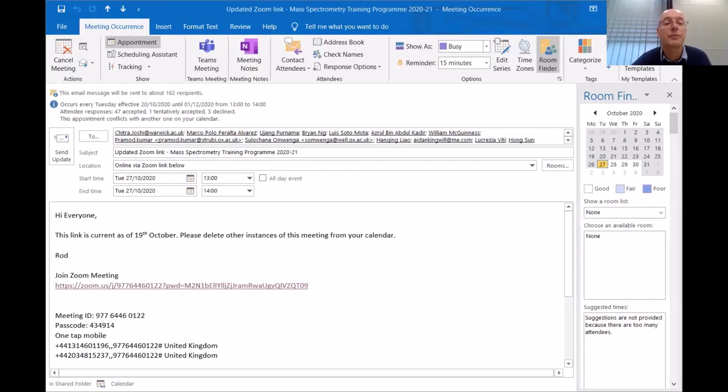I have a question. Whenever we put in the miscleavages, can you connect that to what it means in the actual data that we're seeing? Does it relate to protein coverage? No, it doesn't. I've got an example I can show you. Can I share screens with you again and go back to this data set, if I can.